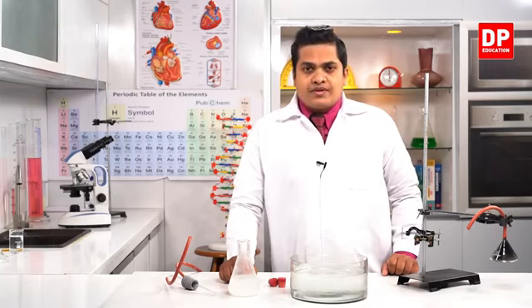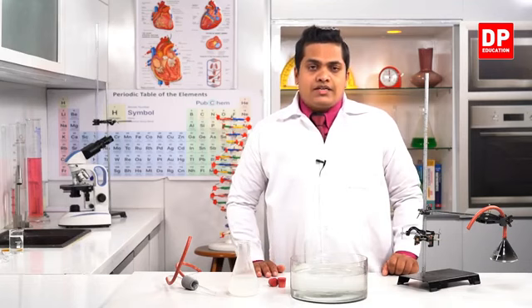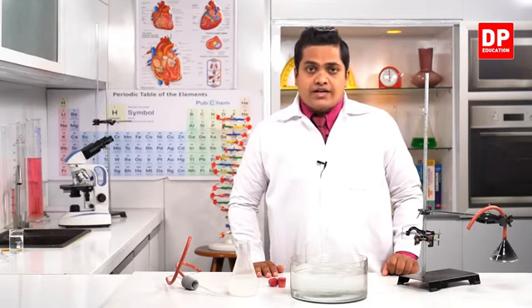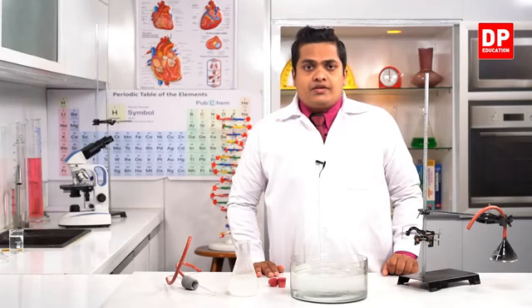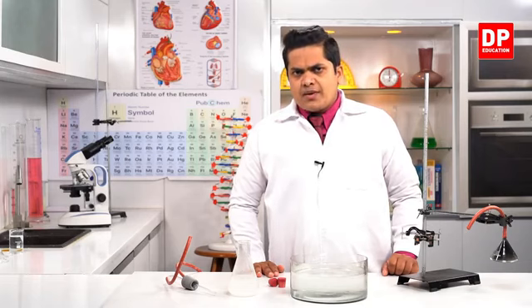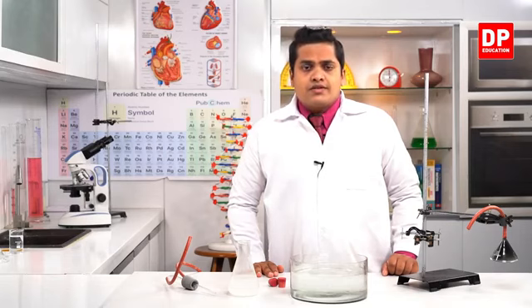gas. So here also you can observe the colorless lime water has changed into milky white color. That's because of having carbon dioxide gas. So where did we receive carbon dioxide to the system? We received carbon dioxide by the burning of candle wax.